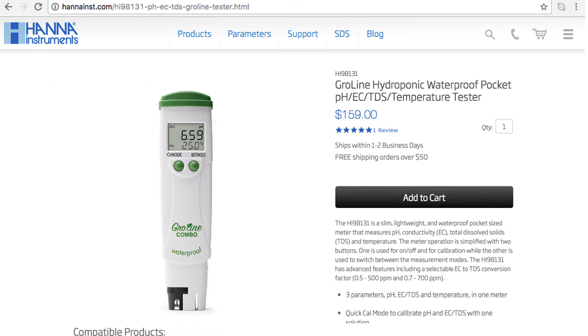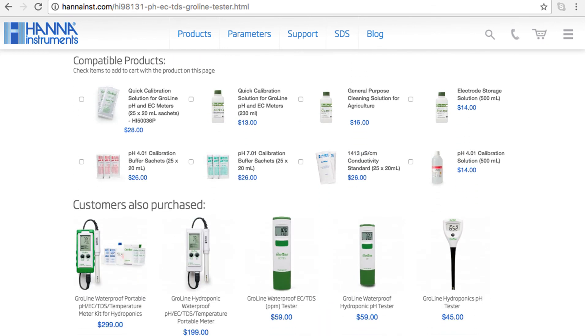The GroLine HI98131 combo tester is a simple-to-use tool for growers who need to test the pH and TDS of their nutrient solutions. You can find everything you need for your tester at hannainst.com/HI98131 — buffers, solutions, and other products can be found right on the product page.